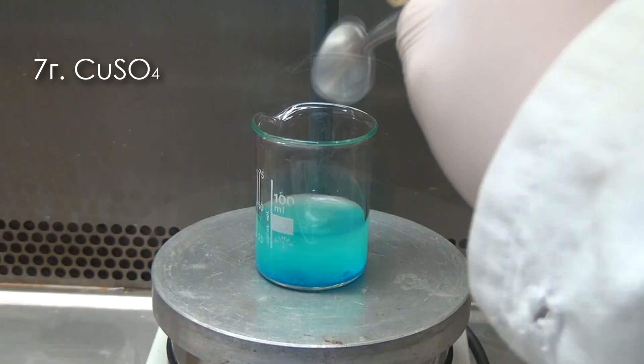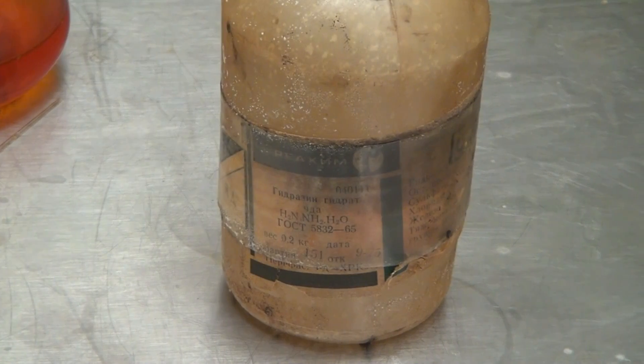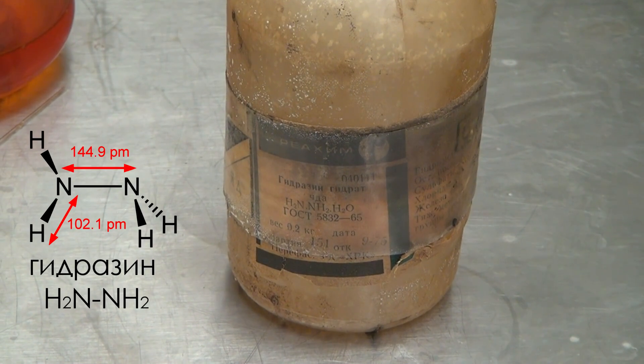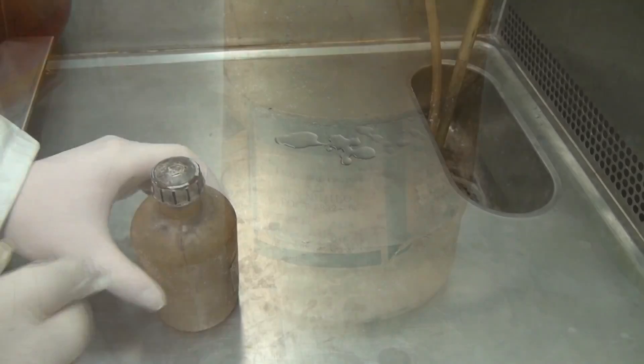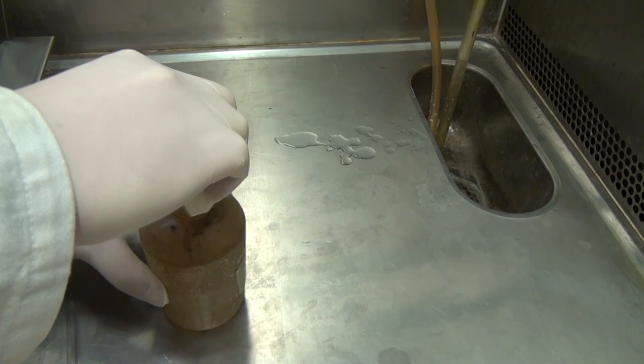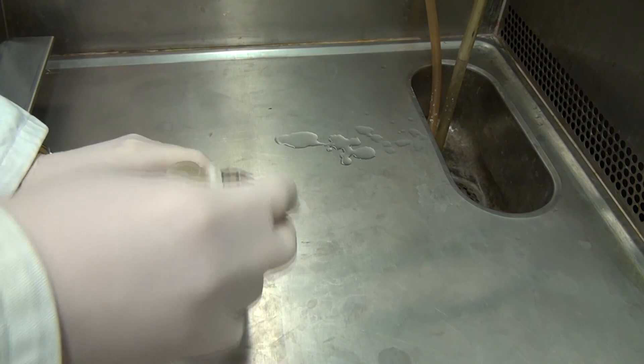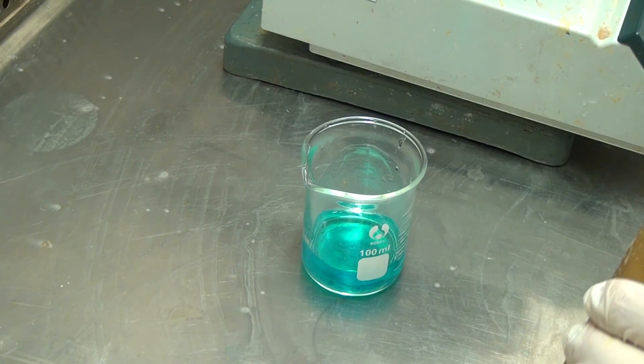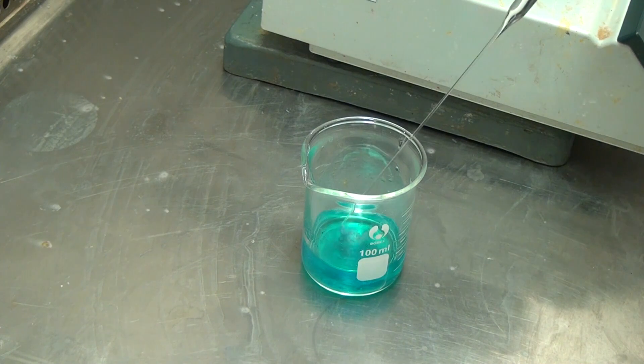We will restore copper to the metallic state using hydrazine. In our university, we found a pretty old bottle with hydrazine, and I hope that it hasn't reached the end of its shelf life yet. To obtain metallic copper, add a little hydrazine to the beaker with copper sulfate.